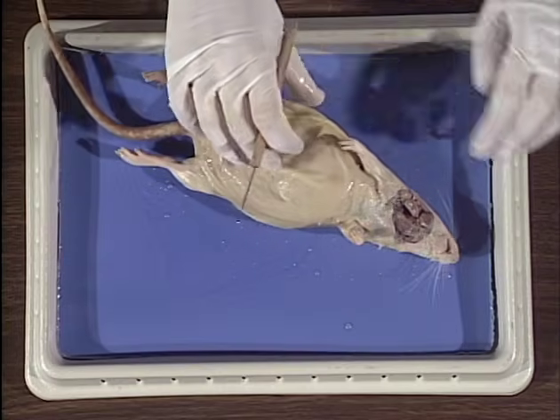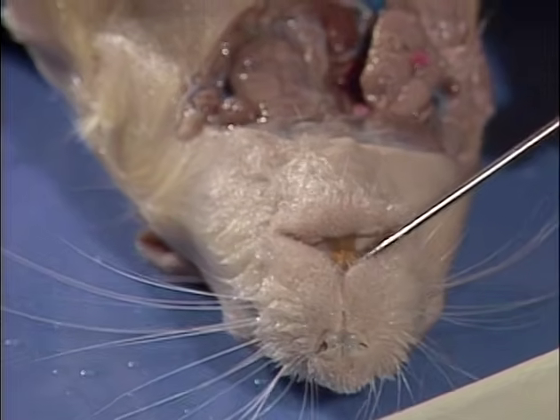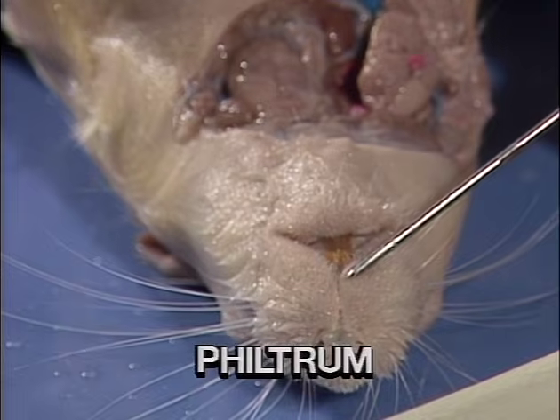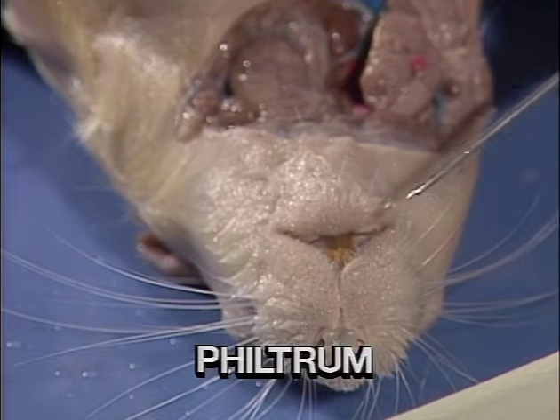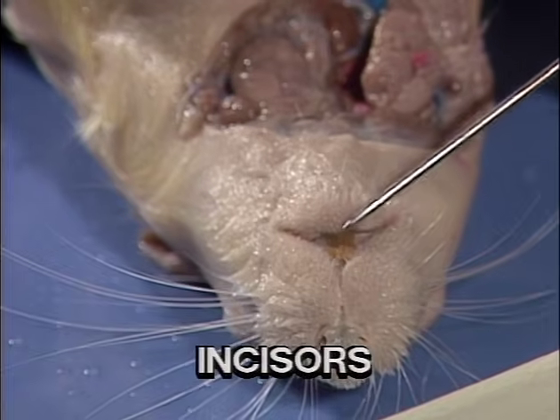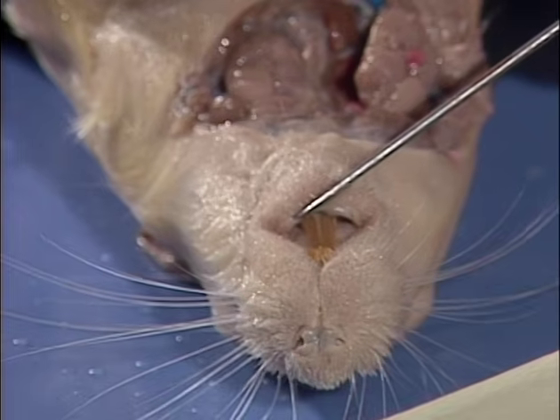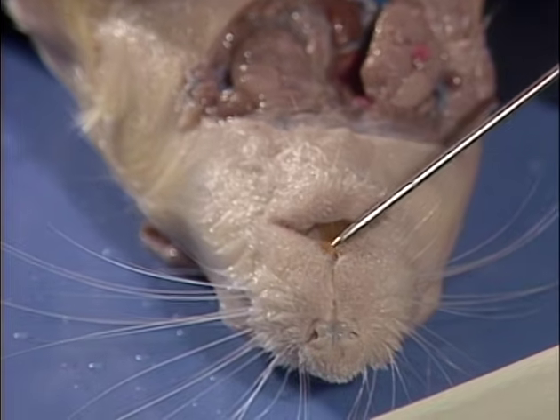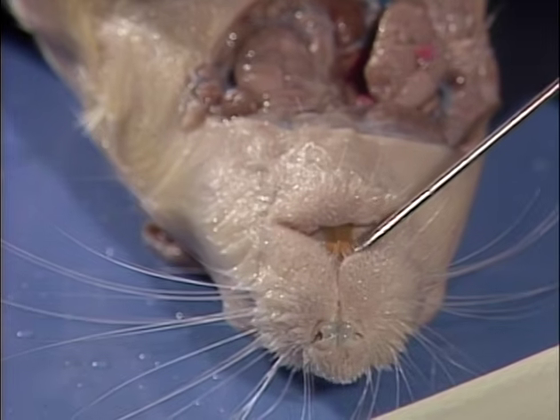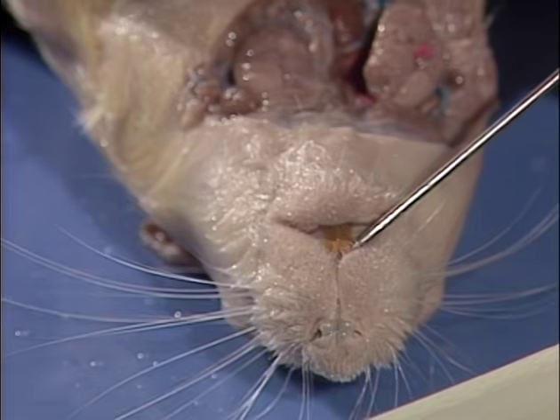Look at the head of the rat and notice that it has both a lower lip and an upper lip. The upper lip has a prominent indentation known as the philtrum. We can notice a pair of long yellow teeth known as incisors. Protruding from the lower jaw is a second set of incisors. Enamel covers only the outer surface of the tooth. The soft dentine of the back wears quickly and keeps a sharp edge on the tooth, a characteristic of all rodents.